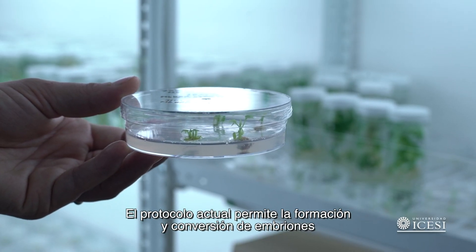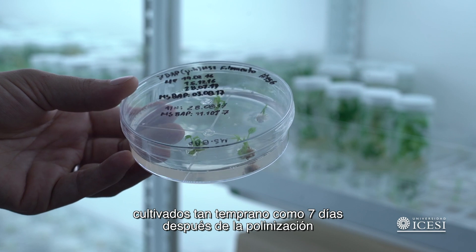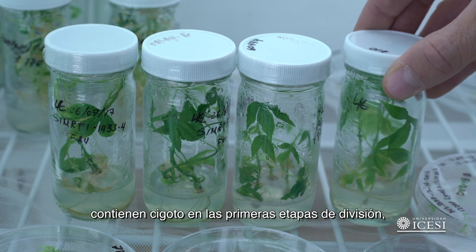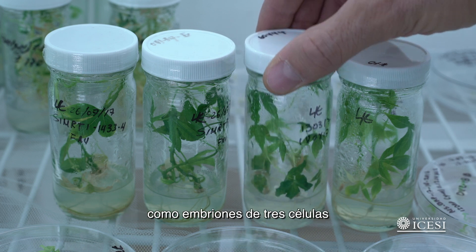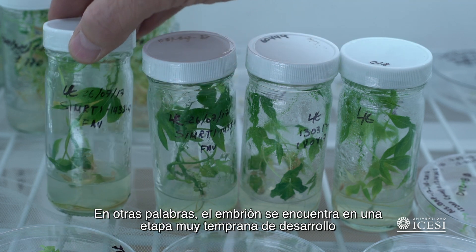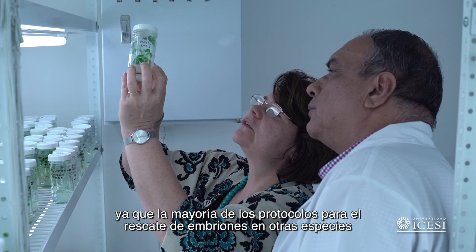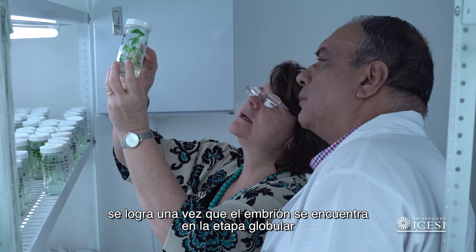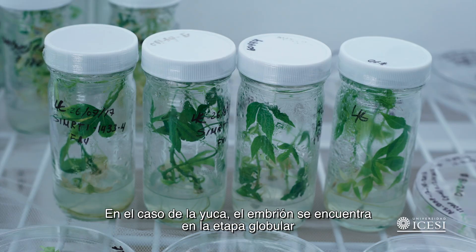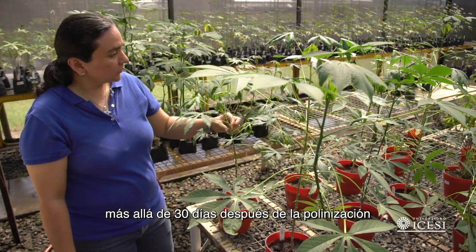The current protocol allows embryo formation and conversion into fully developed plants from ovule culture as early as seven days after pollination. Histology analysis indicates that ovules at seven days after pollination contain a zygote at the first stages of division — as early as the three-cell embryo stage — meaning the embryo is at a very early stage of development. This is a major achievement, since most protocols for embryo rescue in other species are attained once the embryo is at globular stage. In cassava, the globular stage occurs at 21 to 24 days after pollination, and the embryo is fully developed beyond 30 days after pollination.